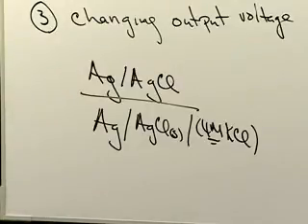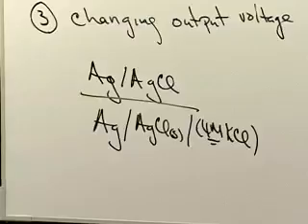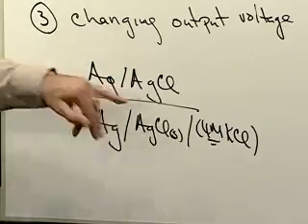That works well. Another, you don't like that one? Well, when I try to, I always end up getting something that drifts. And you actually passed a current and made some silver chloride? Oh, yeah. I haven't seen a lot of drift in that one. Pass a little more current. That could be. Can you actually see the coating of silver chloride on the wire? It should be good.